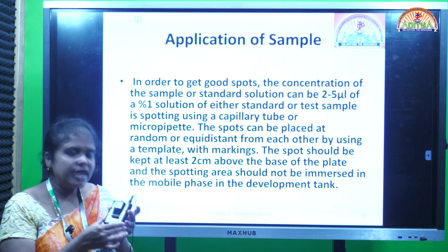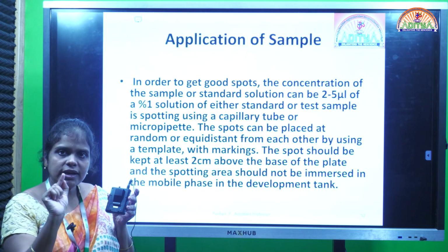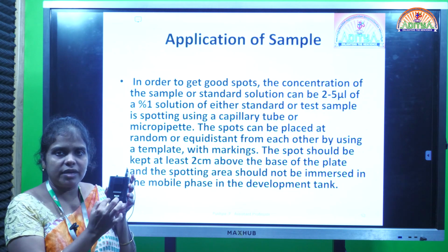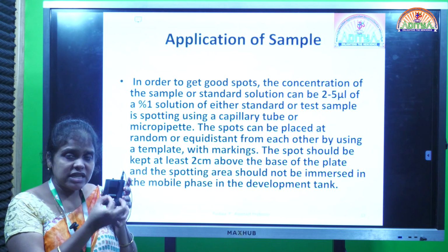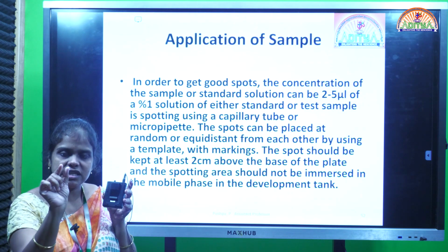Before applying the sample on the TLC plate, we have to apply it 1 inch above the base. For example, this is the TLC plate. At the end, you should not apply the sample. 1 inch above the bottom of the TLC plate, you have to start applying the spots. And for each sample spot we apply, there should be a 1 centimeter gap.